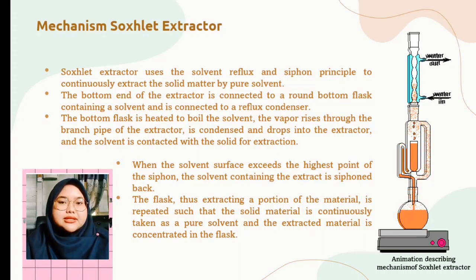When the solid chamber is almost full, the chamber is automatically emptied by a siphon sidearm, with the solvent running back down to the distillation flask. This cycle may be allowed to repeat many times over hours and days.